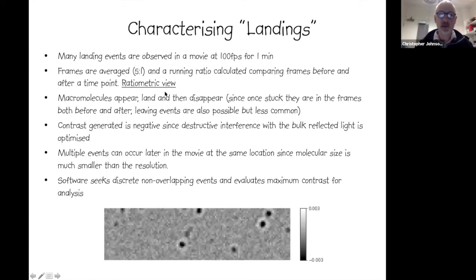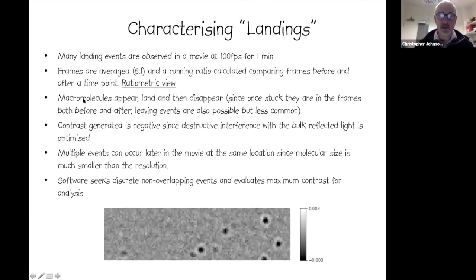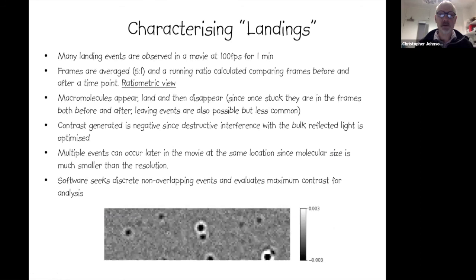It's a so-called ratiometric view. So therefore, what we see and what you see in the movie below is that the molecules appear, and then they land, and then they disappear.